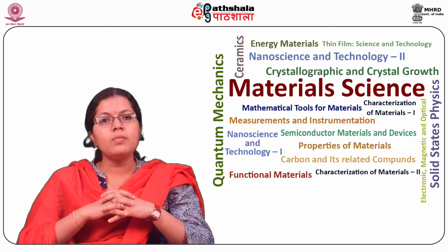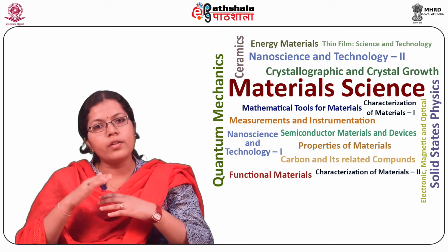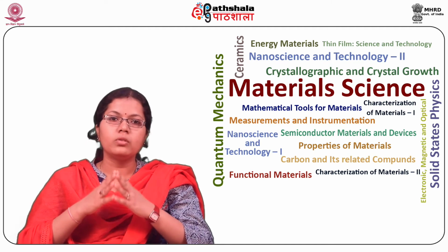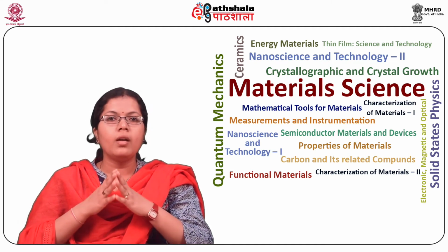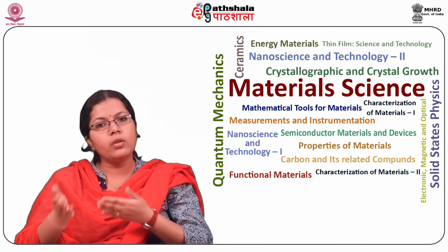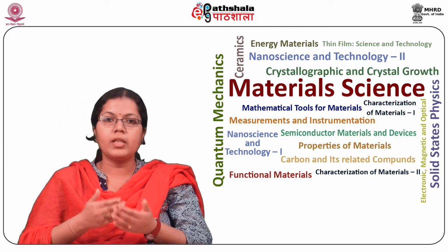Thus, it is possible to concentrate on a small region of the sample, typically from micrometer level to downwards, and obtain information on microstructure, crystallographic details, and chemical composition.